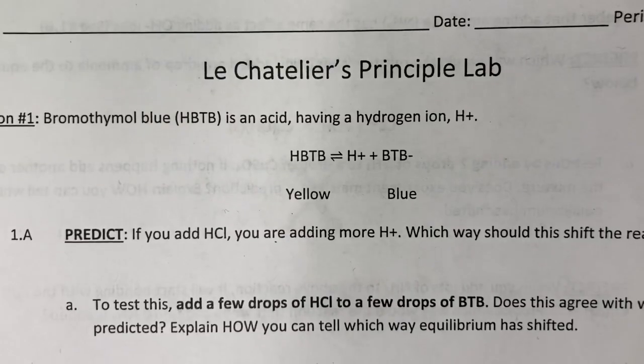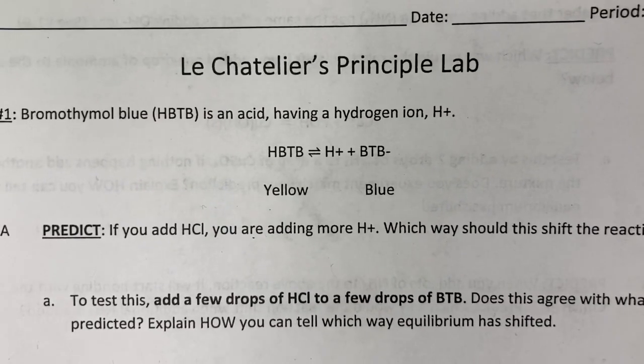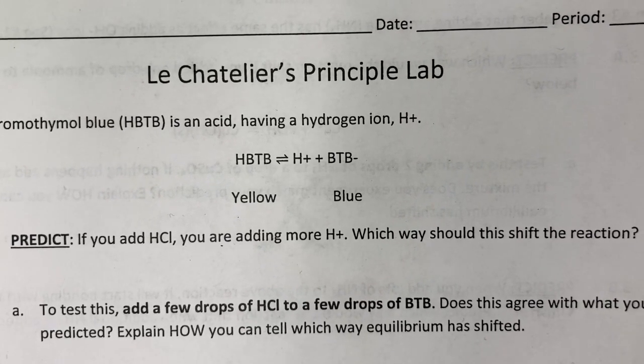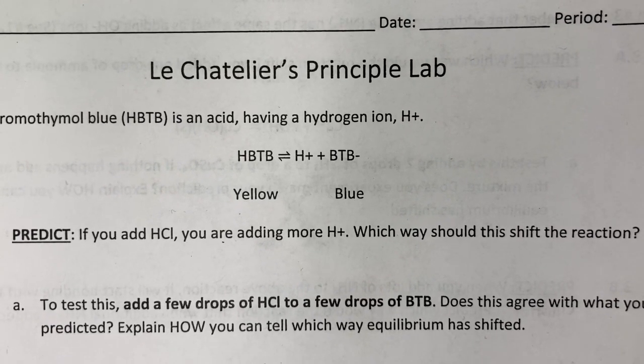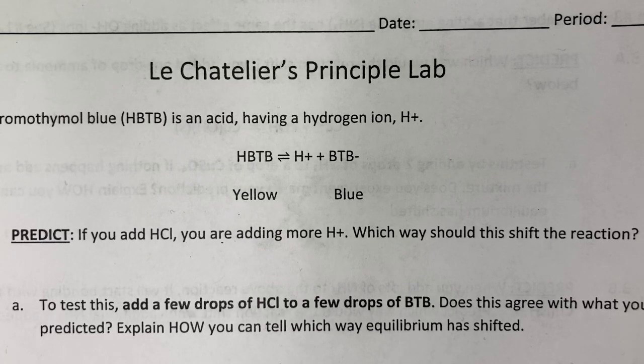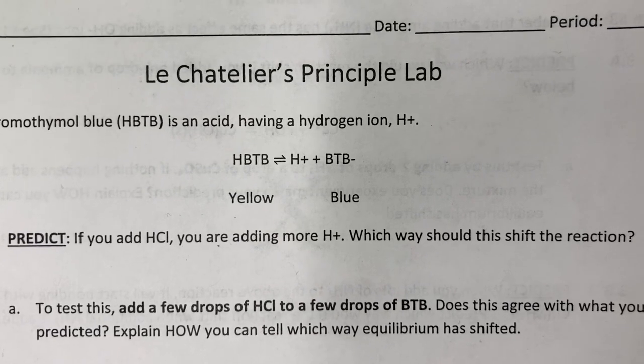For the first one, we're going to be looking at BTB. So predict what's going to happen if you add more HCl. Okay, take a moment to predict, maybe pause the video. Okay, next we're going to see what this looks like.